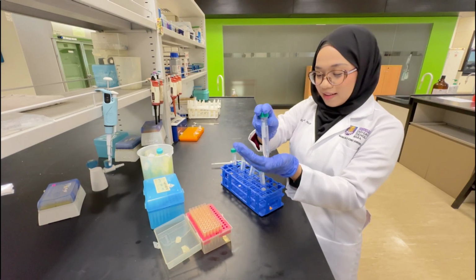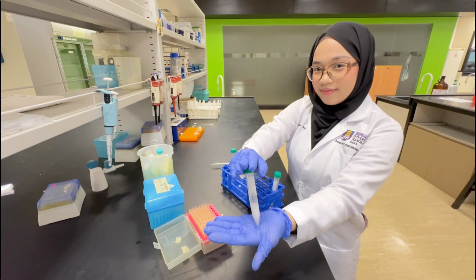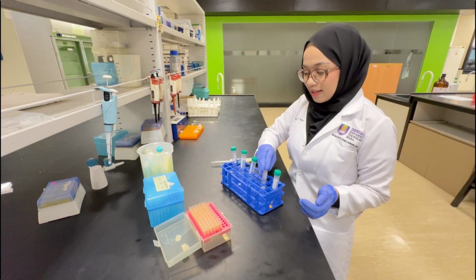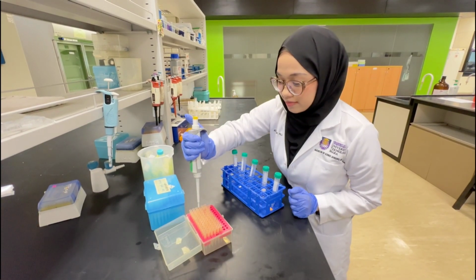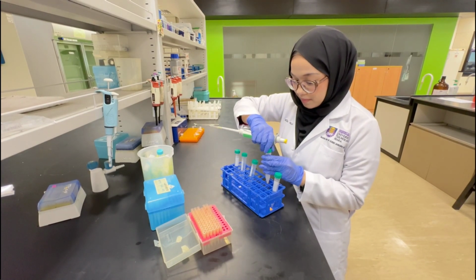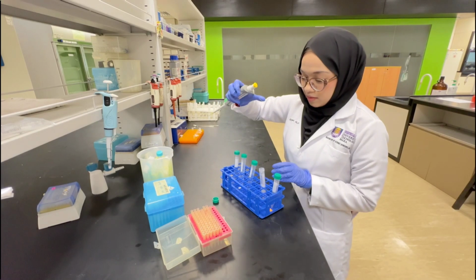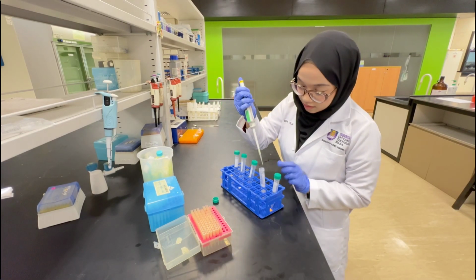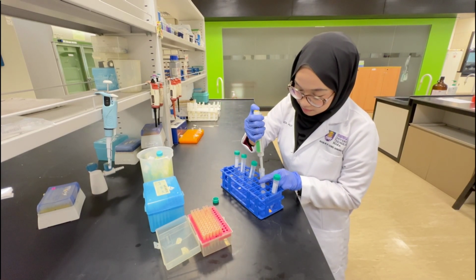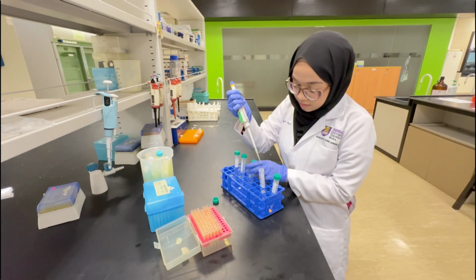This is blank and this is sample containing. Let's take a look on how I prepare the sample. Prepare the sample by dissolving it in a suitable solvent. Ensure the sample is free from particles by filtering or centrifuging if necessary.